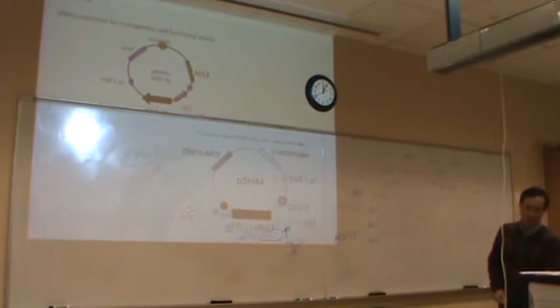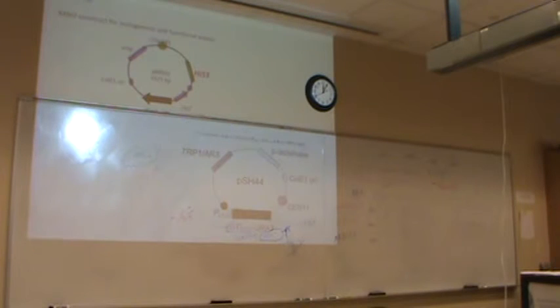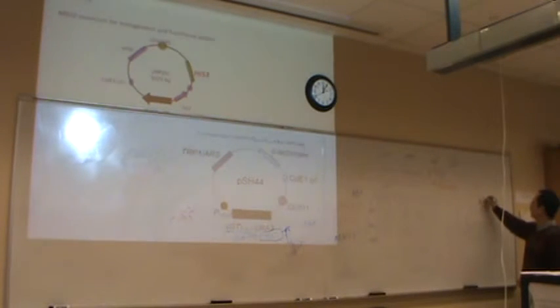So I'm going to take a picture of this and everyone should also write a summary of this in your notebook, and I will check this at the end of the class after the participation break. You should write a summary diagram: the plasmid, what's a strain. Those are the yeast strains.